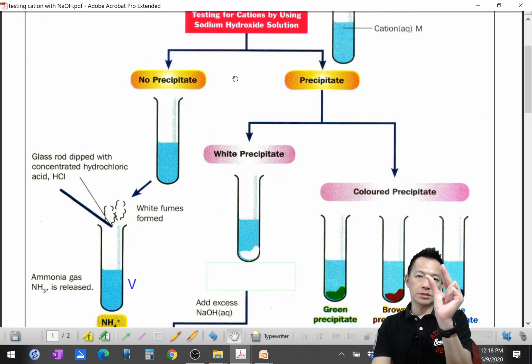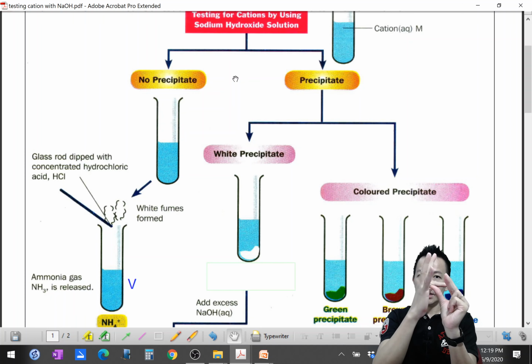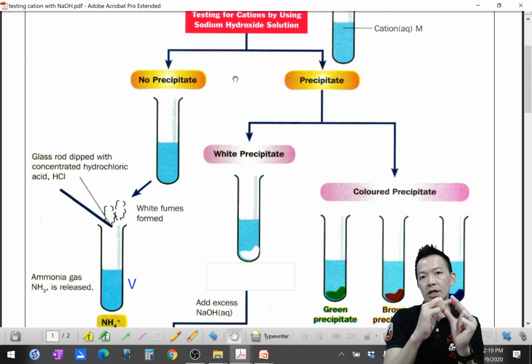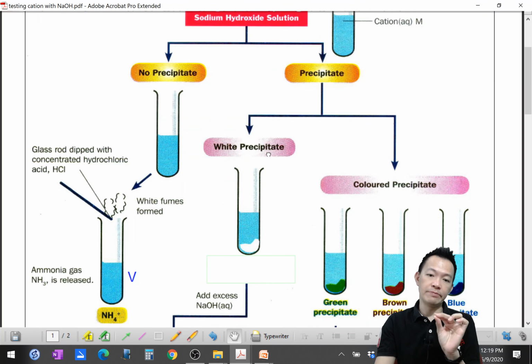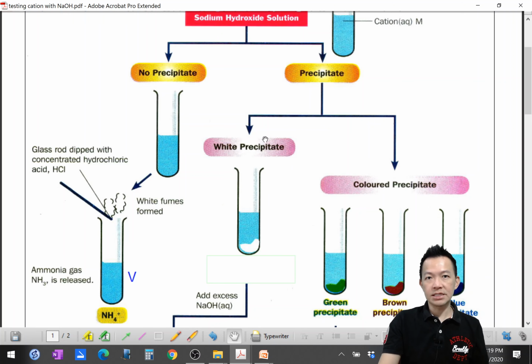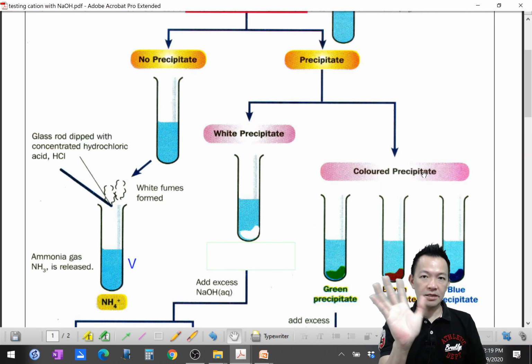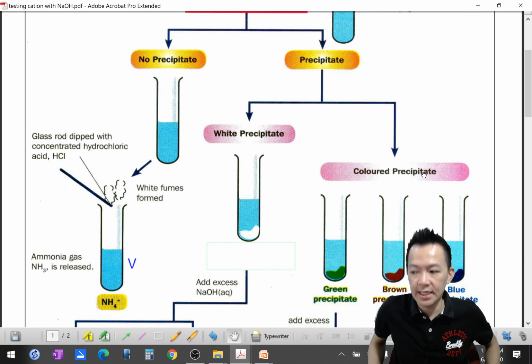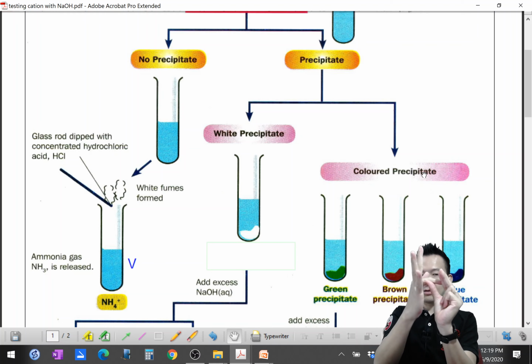Okay, salt solutions, and now I add the sodium hydroxide. And now you can see the precipitate. As soon as you add a drop, the precipitate will be formed. Some powdery stuff comes out, and this is what we call precipitate. When we talk about precipitate, we have two types: white precipitate, or colored precipitate. So what is a white precipitate? Nothing to worry about, I am going to show you the video. I will show you very clearly.